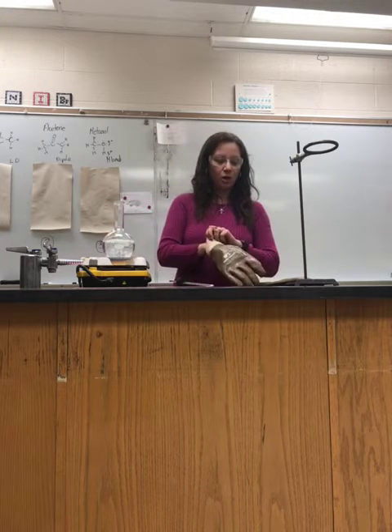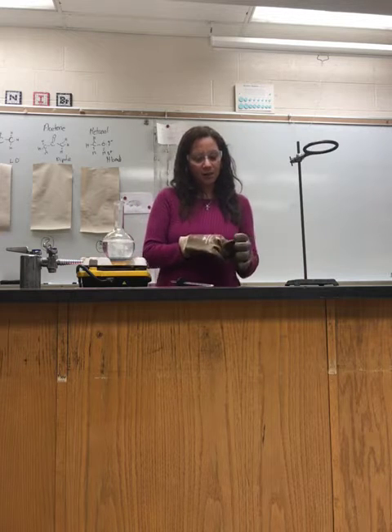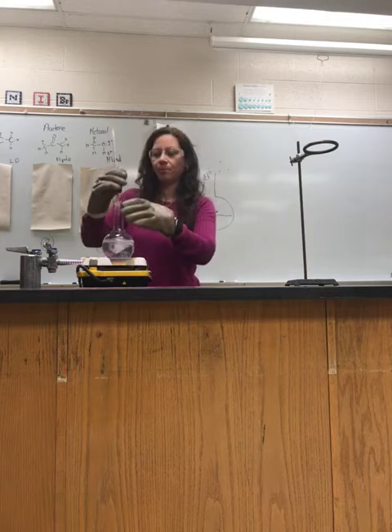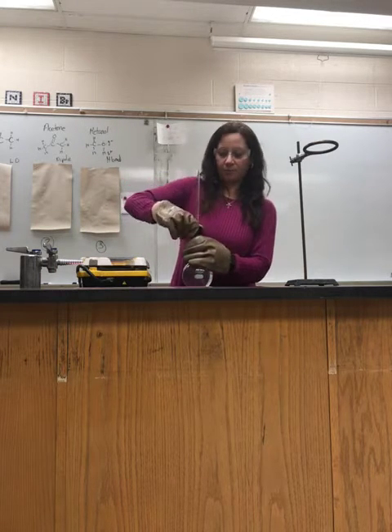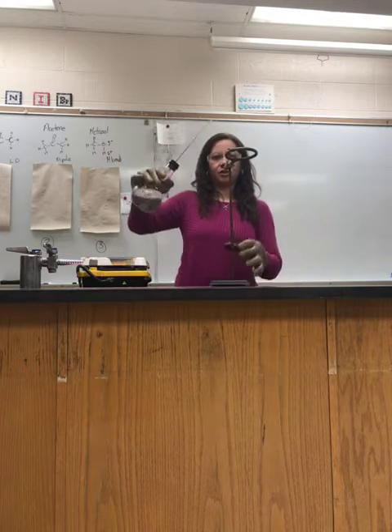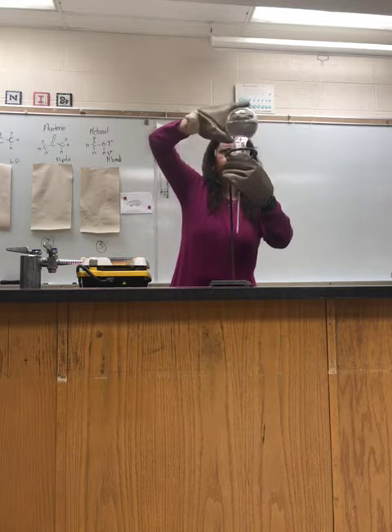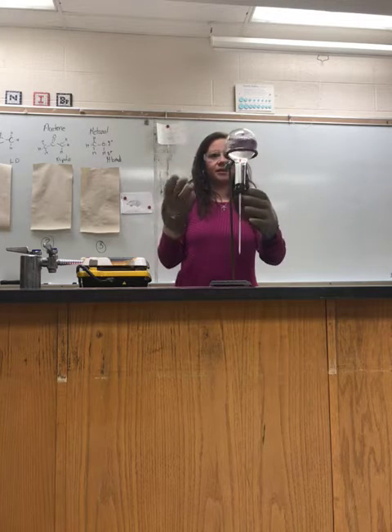So I'm going to go ahead and, now that my vapor pressure is equal to the external pressure, I'm going to stopper my flask. I have a stopper that has a thermometer through it. So I'm going to stopper my gas and take it off the heat. And I'm going to flip it upside down so you can just see it better. And right now you see that it's not boiling anymore.